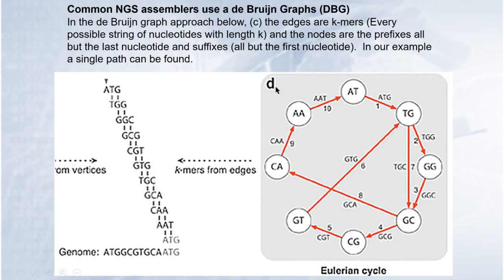Excuse me, let me go back. And so what the algorithm attempts to do is find a way of going through a graph, like is depicted on this set next to it, that attempts to step through each of those KMers and essentially aligning the KMers such that you would end up with a single path that takes you from one end of the genome to the other, representing all the different possible KMers that are there.